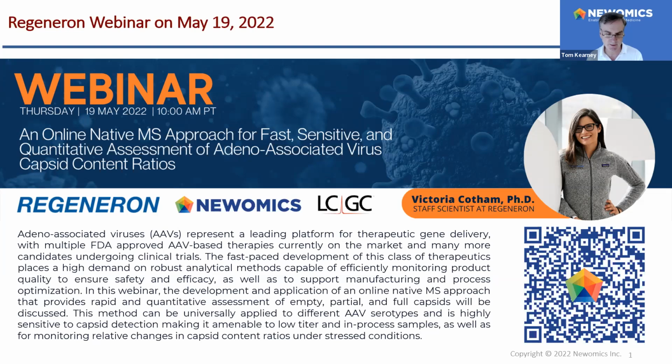First, I'm going to give a brief overview of the Newomics multi-nozzle emitter technology and discuss the compatible mass spec instruments and applications. Then we'll have our feature presentation with Victoria Cotham, and after the presentation, we'll have 20 minutes of Q&A.